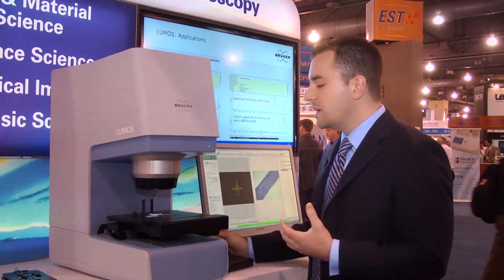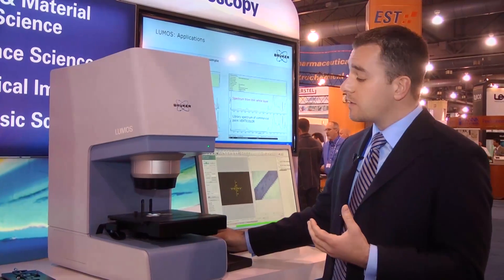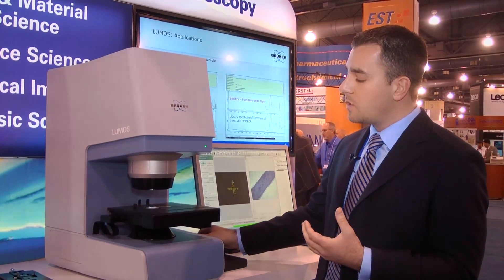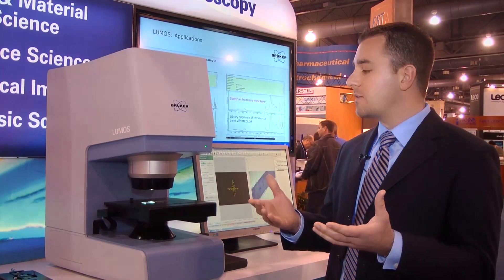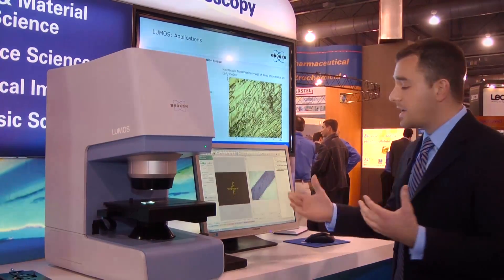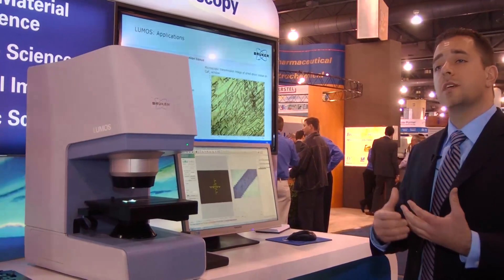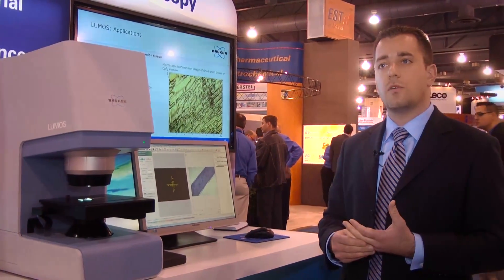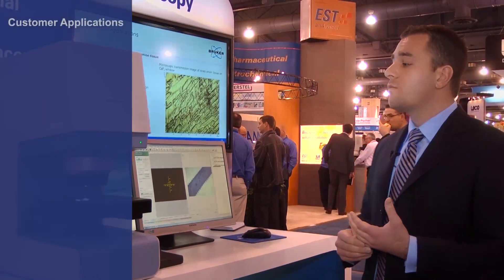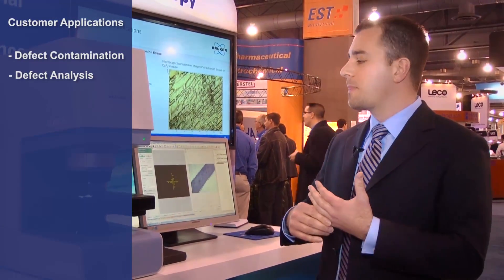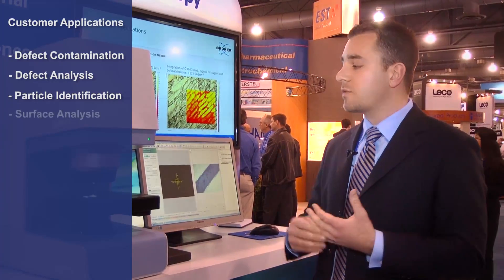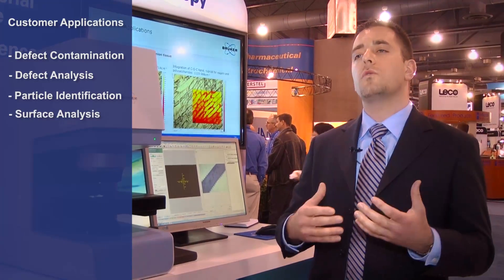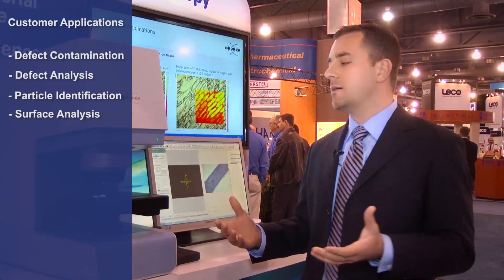You have a lot of open access, and then when you're ready, all you do is bring the stage up and you're ready to do your sample analysis. A typical ATR sample would cover defect contamination or defect analysis, particle identification, surface analysis — the typical FTIR microscope samples.